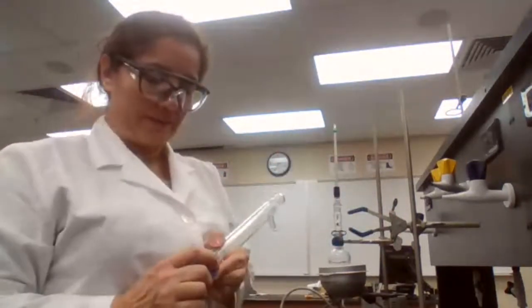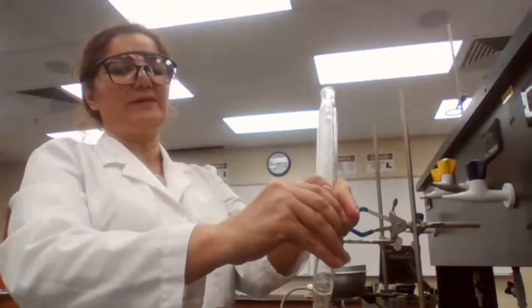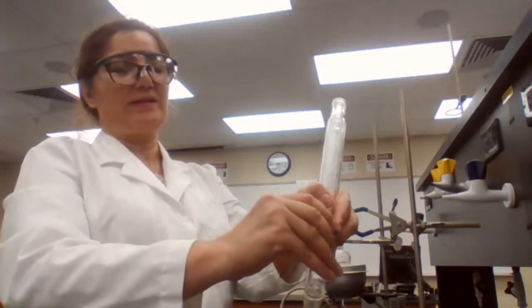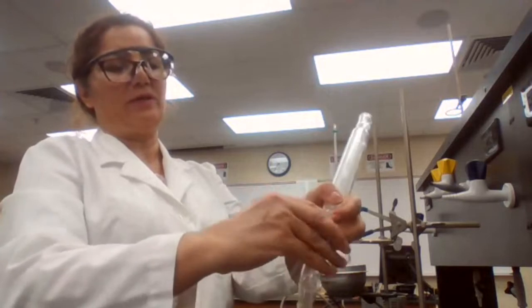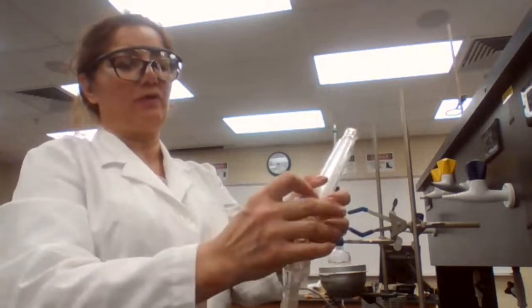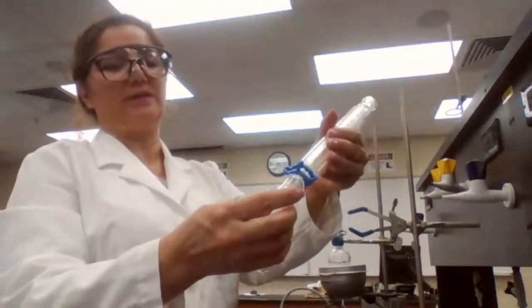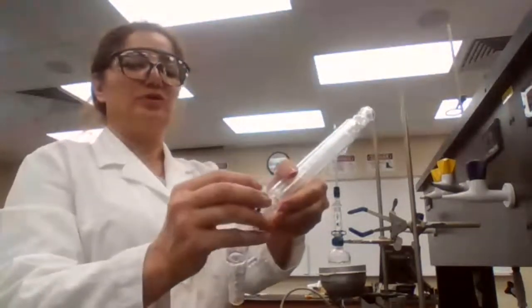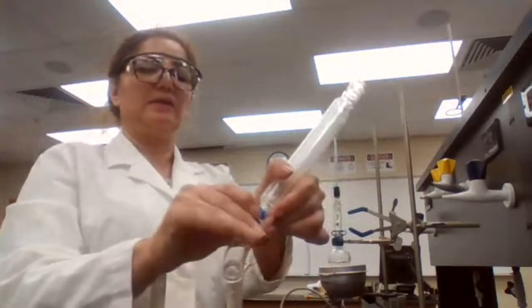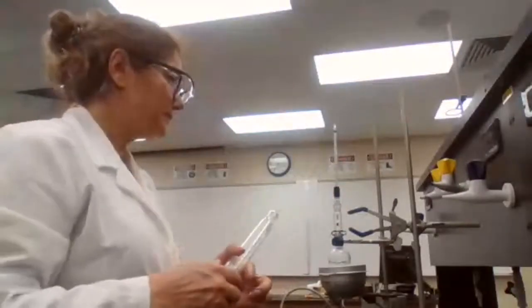If you try the opposite way, it's not going to be easy to fit, and even if you force it, it's not going to hold. And you want to make sure that this clamp doesn't go only on one side, because then it's still not going to hold. The only way that it's going to hold is if you have it just at the joint, with the large side on the large part and the smaller diameter on the smaller side.